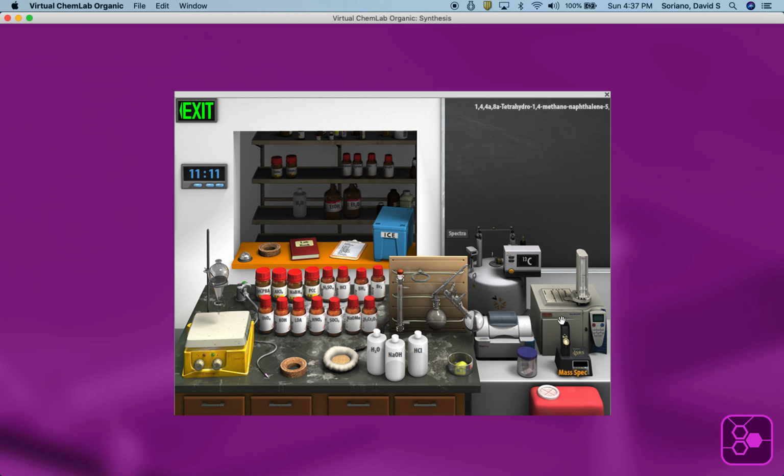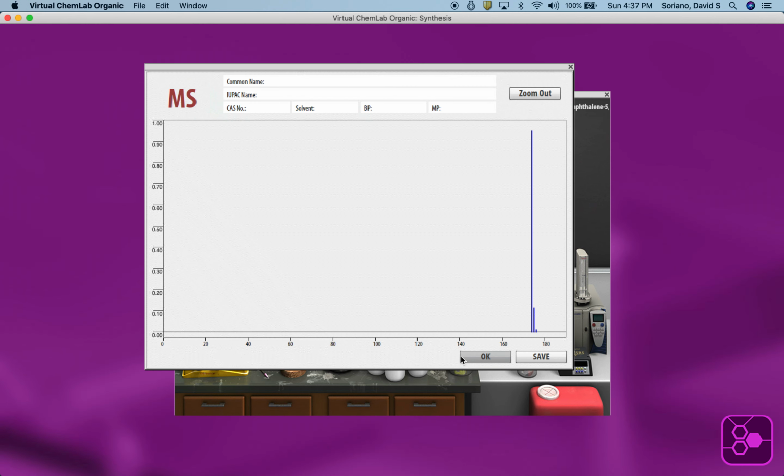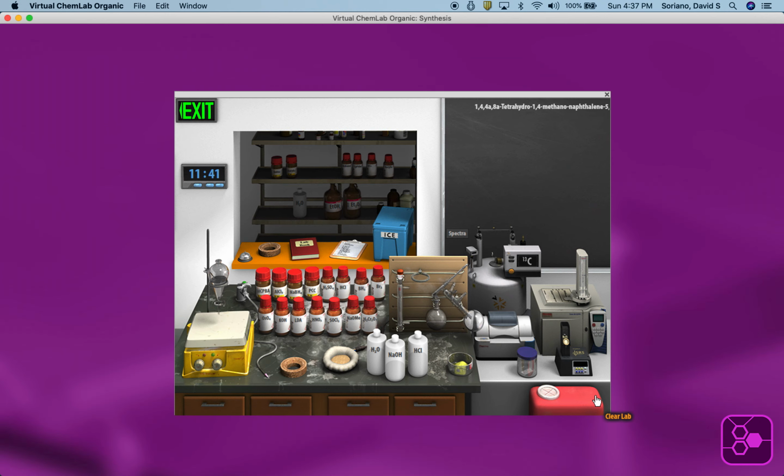Now watch how this is done. Oh, mass spec. Fragmentation pattern. And the molecular ion is the base peak as well. That happens once in a while, not all the time by any means, but here it does. And then melting point. Now, this is how we do this. Bring that over. 77 degrees. That's when this compound melts when it's pure. And I would have students look that up and verify that that would be the melting point.